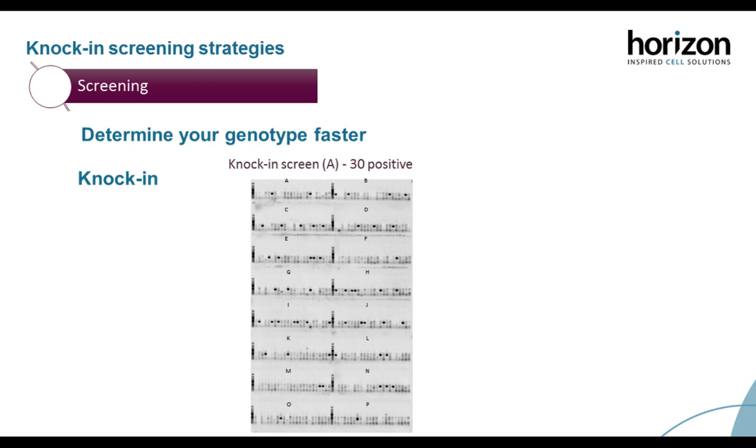So now that we've screened our cells, we're going to go on to the validation. And there is really no shortcut to the validation. You just have to do the validation. It's very time consuming, but it is very important to understand what you'd be working with.